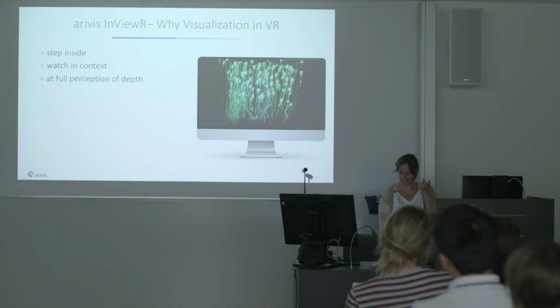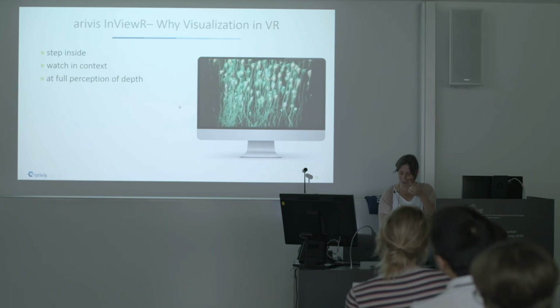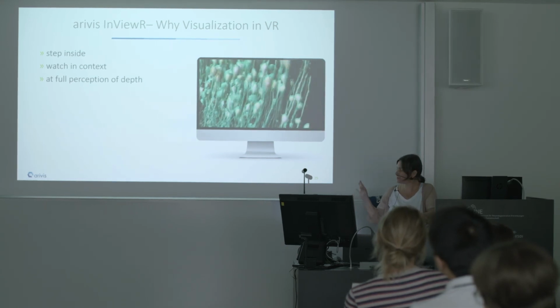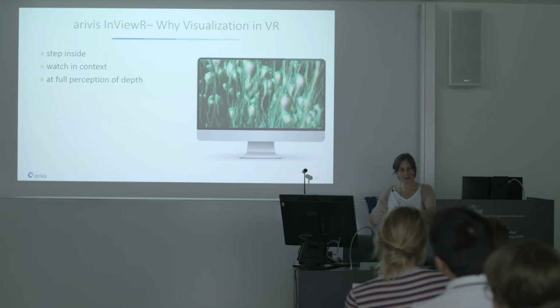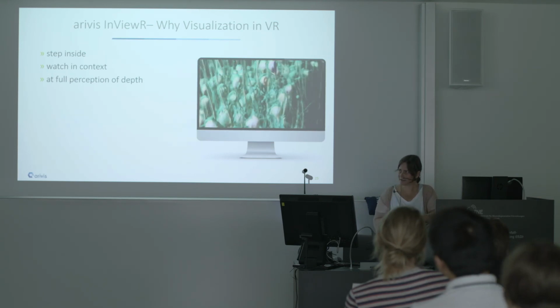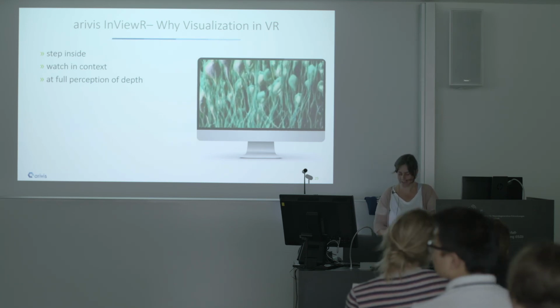But before, David is going to give you the demo live, and it is a little bit more impressive. So we are going to screencast that here on this screen, and you can follow what David is doing.